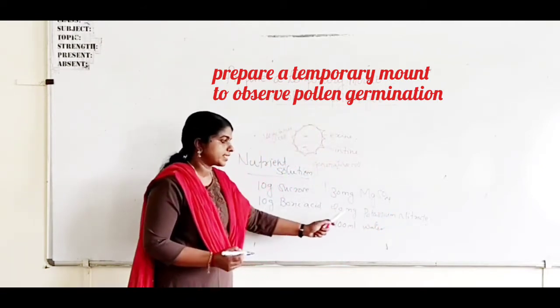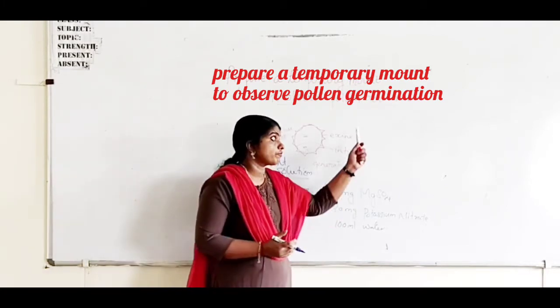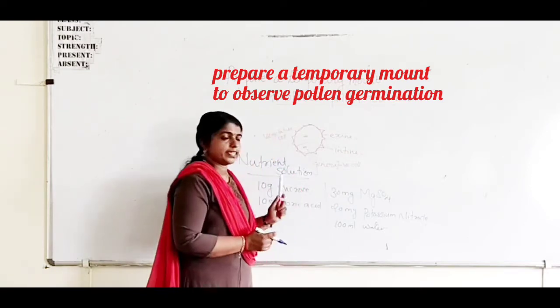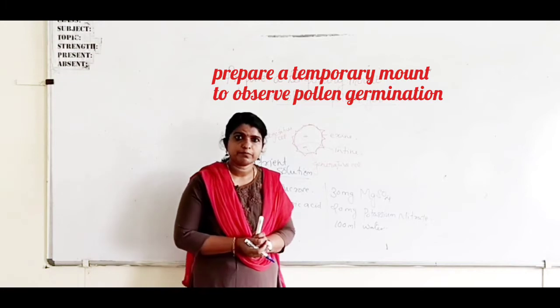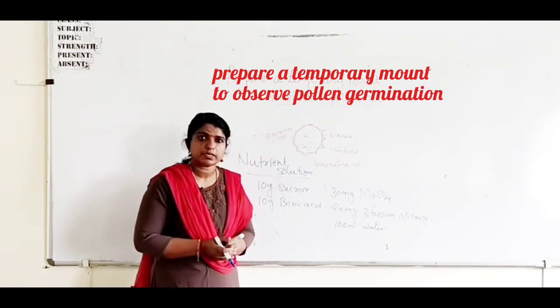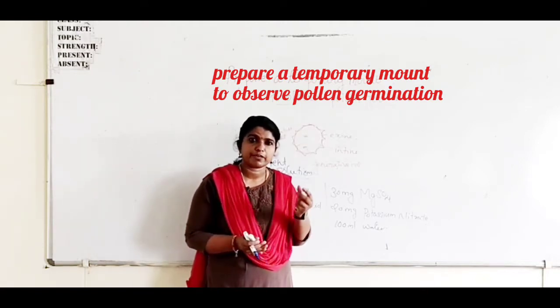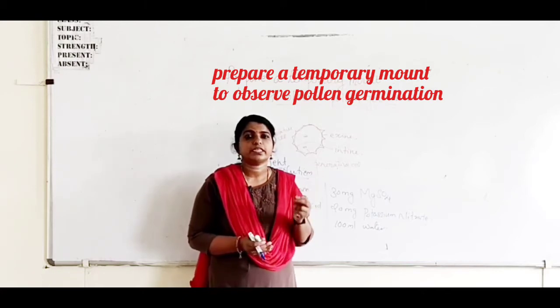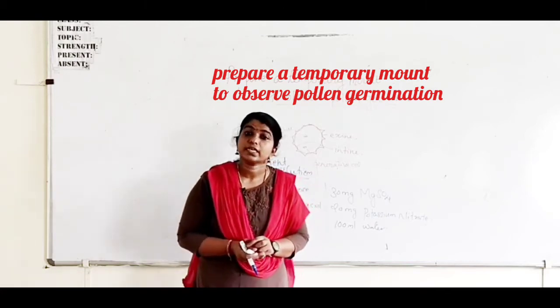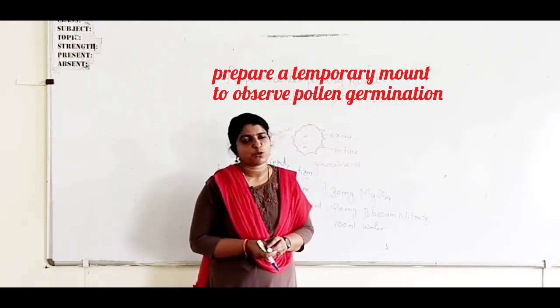When we mix all these things in water, we will get the nutrient solution for the growth of pollen grains. After this, take a slide, add some drops of this nutrient solution, and in that solution dust some pollen grains from the freshly plucked flower.